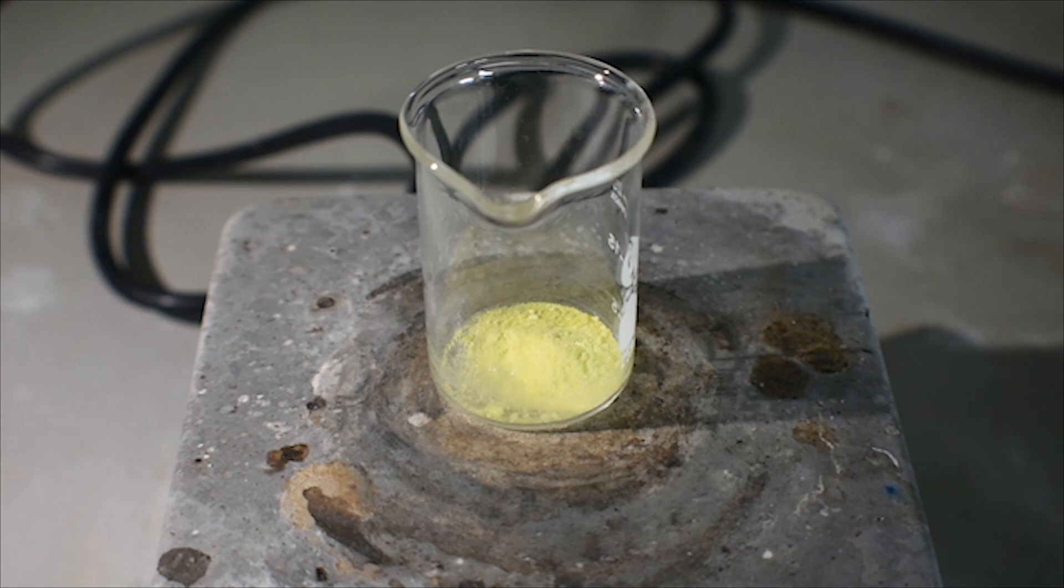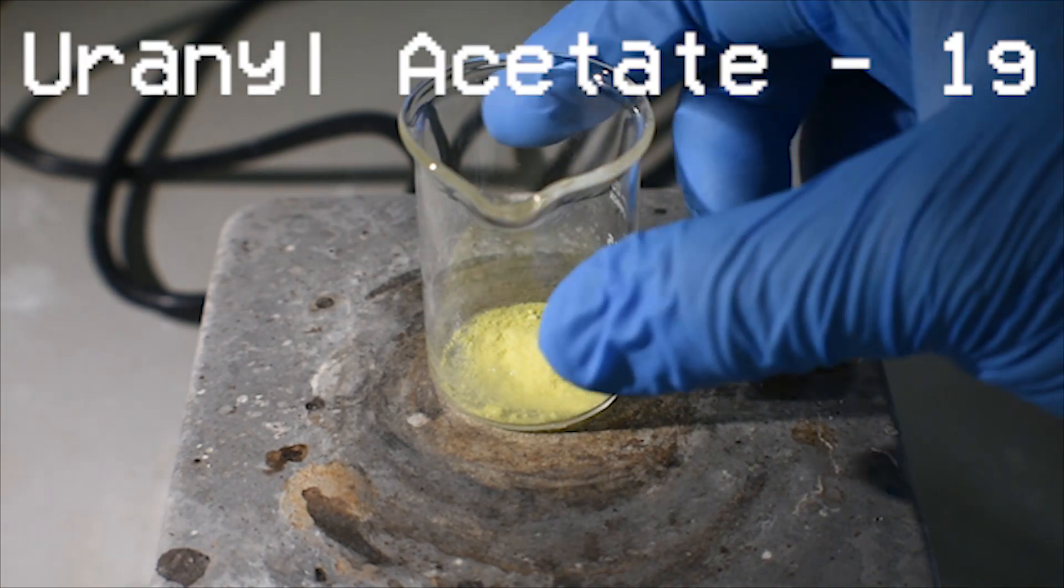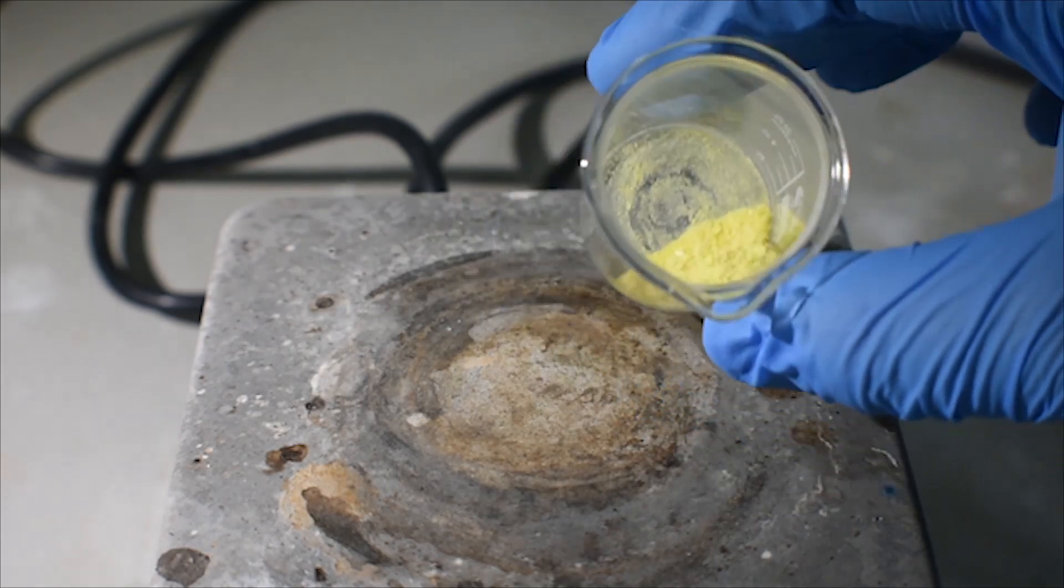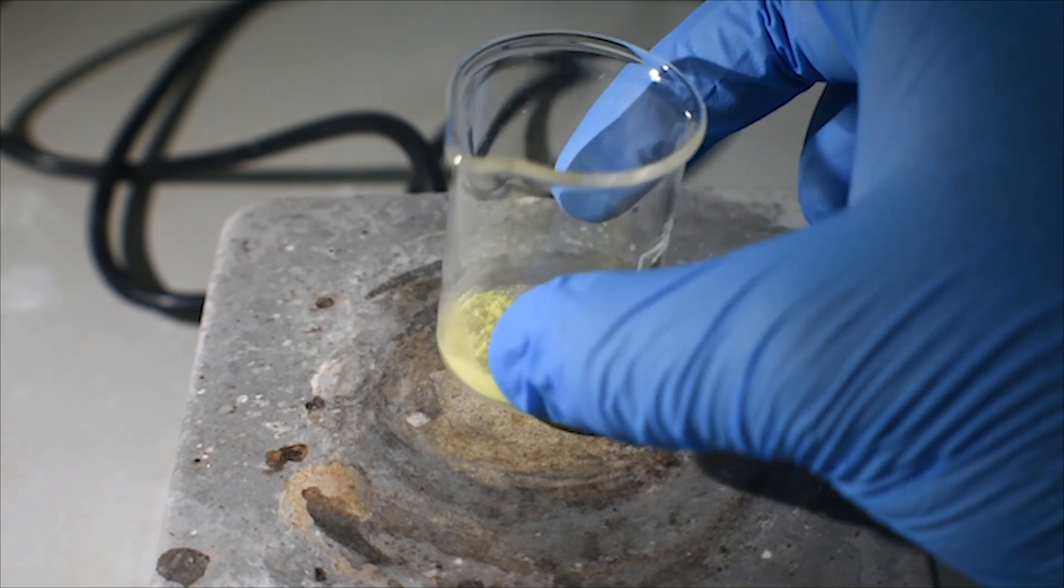To begin, I've weighed out one gram of urinal acetate. It is a bright yellow, green, lime green solid which is fairly soluble in water, but not to any great extent.